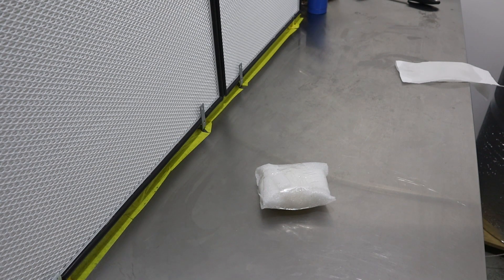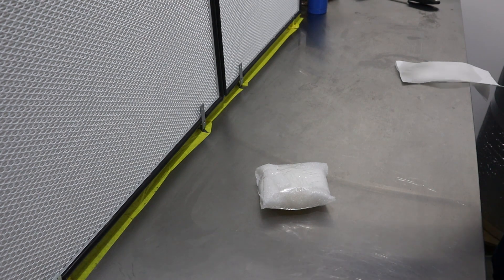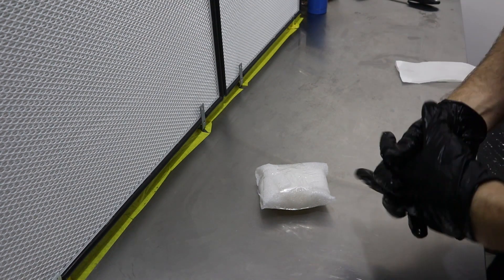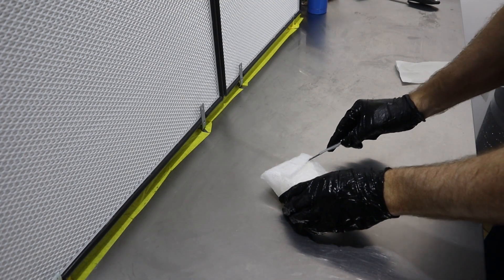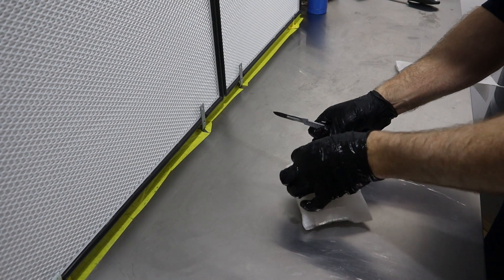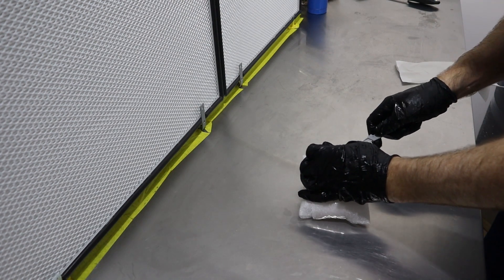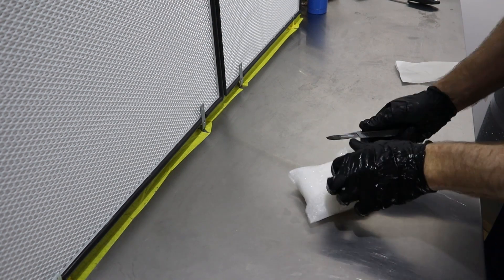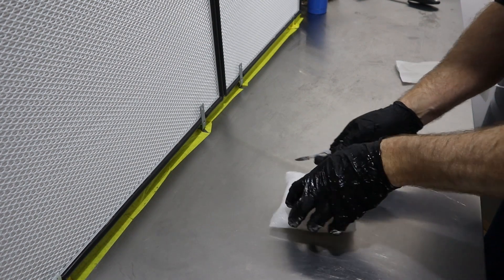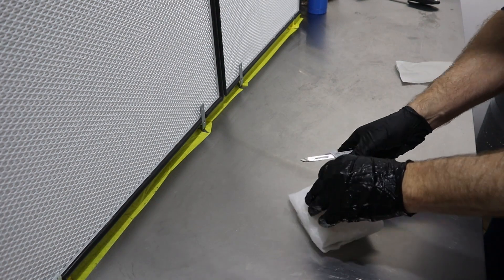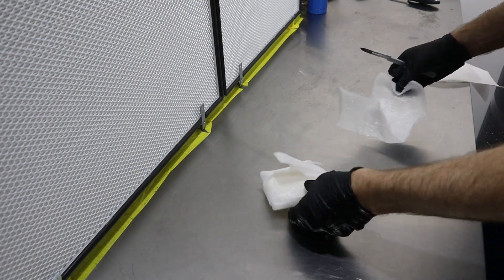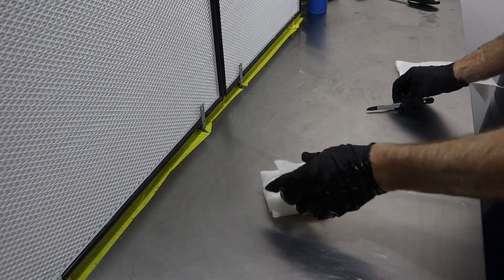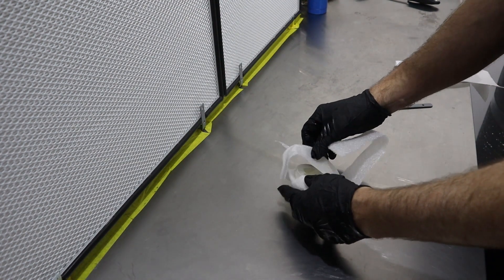Obviously I don't know how sterile the area was when they packaged this, so I'm going to assume it was a non-sterile area. I just want to make sure my hands and whatnot are clean.